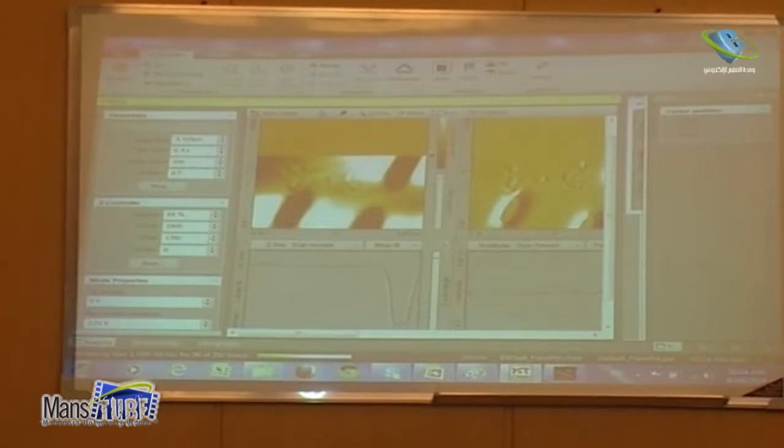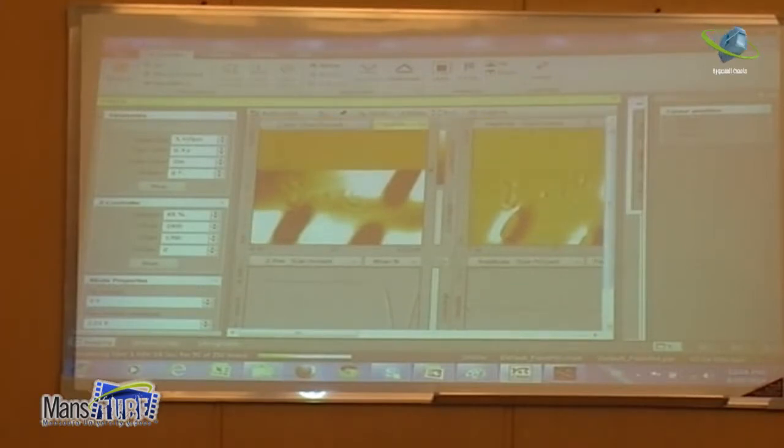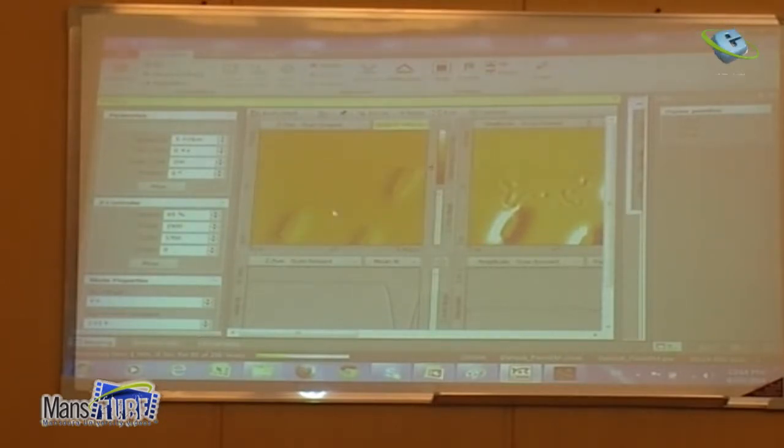I mean, yeah, you see it a little bit here, and you can see it much better on the screen. Let's start. But you can see it.